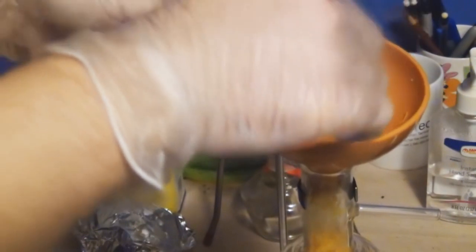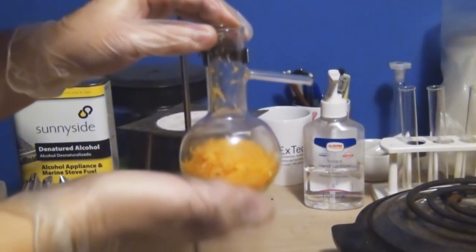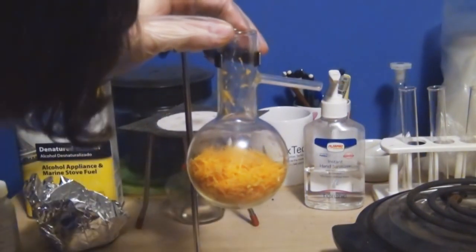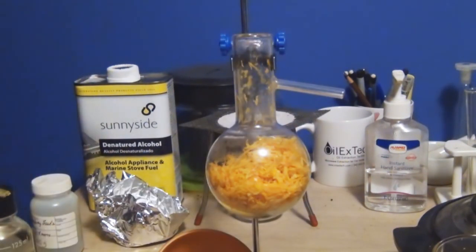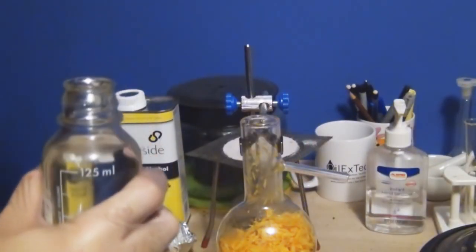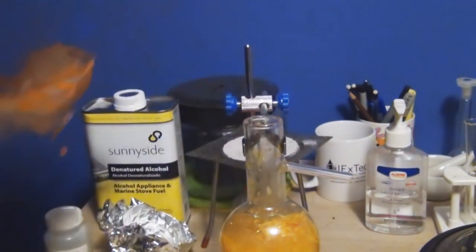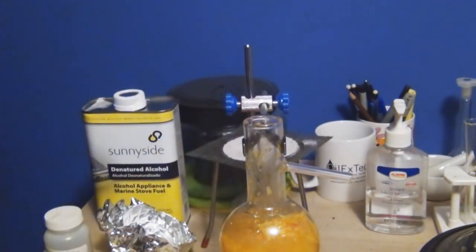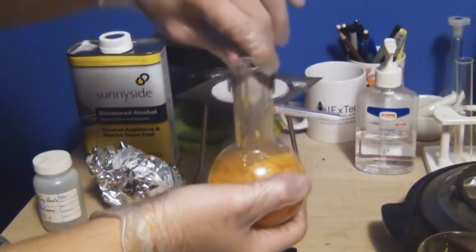I would definitely recommend using a funnel to add the orange zest, or you're going to have a real hard time getting any of this into this really long neck flask. Even with a funnel, it'll take a minute to get everything into the round bottom, but after we finally finish that, we're ready to add our water. It will take two distillations since we have such a small system, so we're going to add about half of our orange peel and 135ml of water to this first round, and then the same to the second.